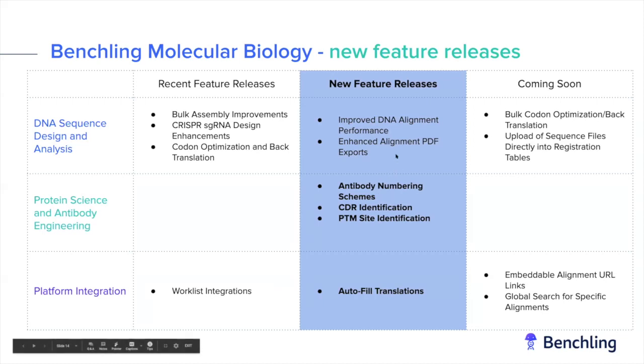Another set of alignments enhancements that we've made in the last month or so is around enhancing the PDF exports of alignments. You'll see that we've added a lot more flexibility there in terms of exporting your alignments, both protein and DNA alignments.